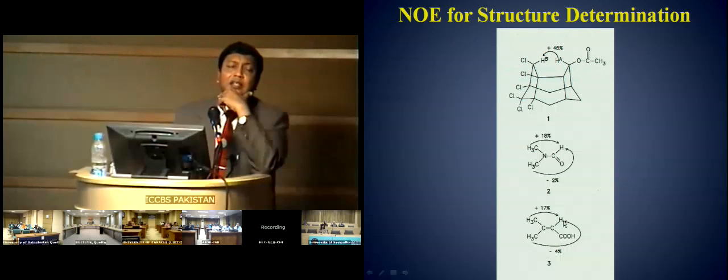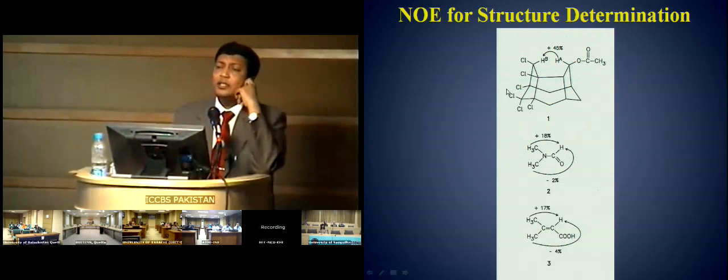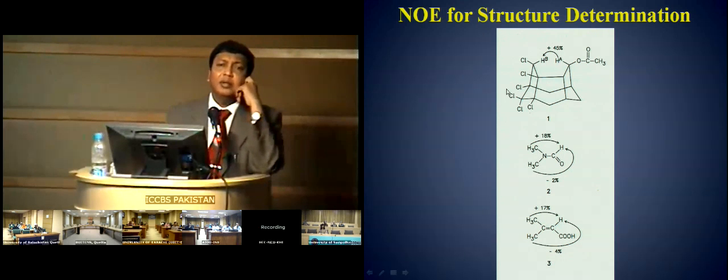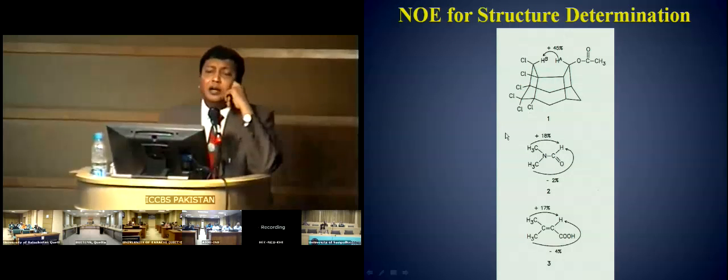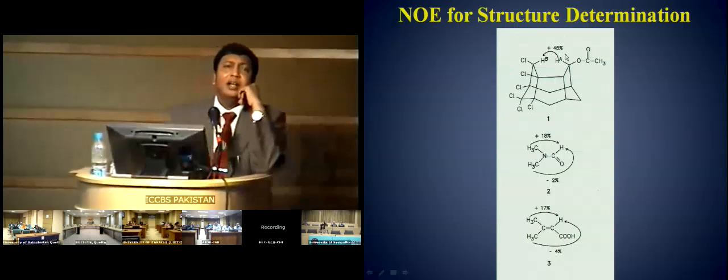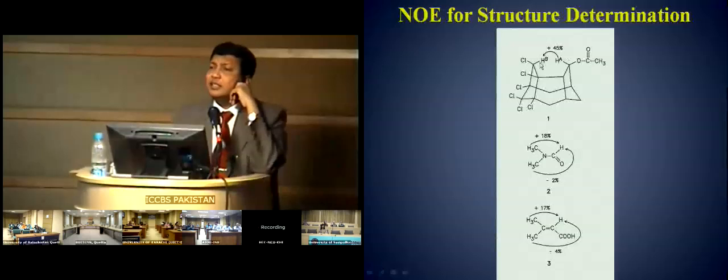if I tell you that this so-called steady state one-dimensional NOE, so-called equilibrium NOE, nuclear Overhauser effect difference spectroscopy, this figures means absolutely nothing. Because when I say that there is no reciprocal NOE, it means that you cannot correlate this NOE with the internuclear distance.